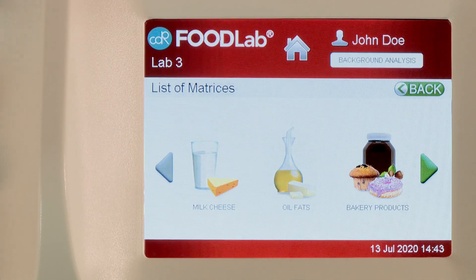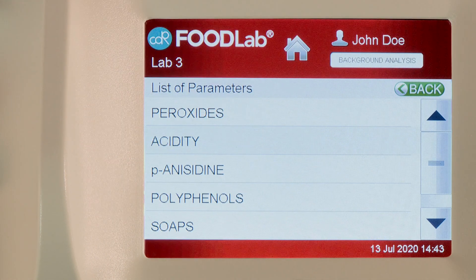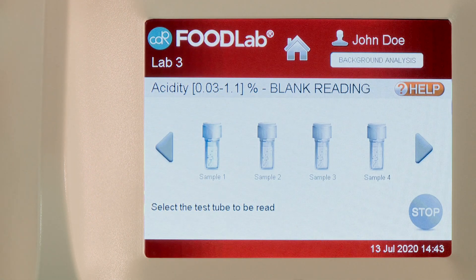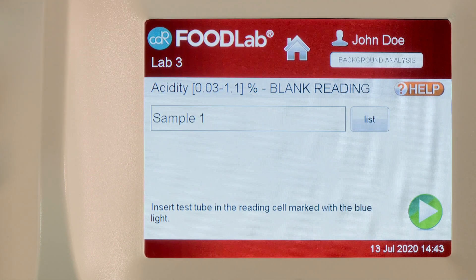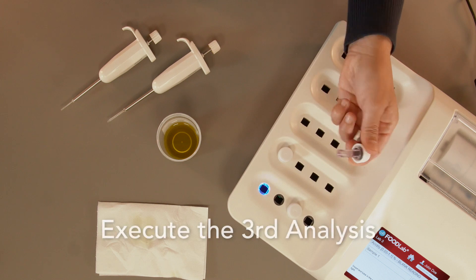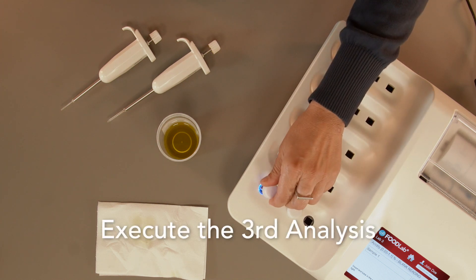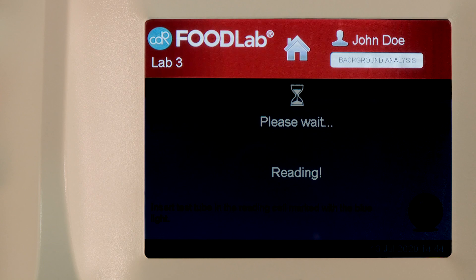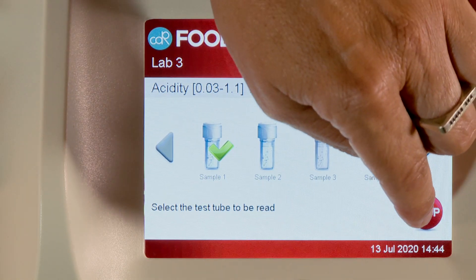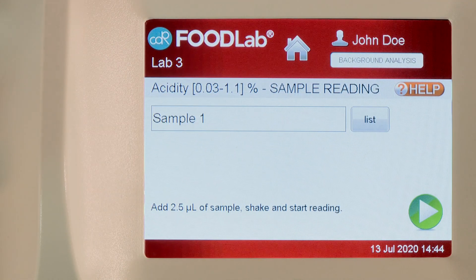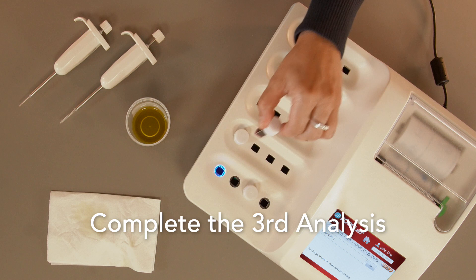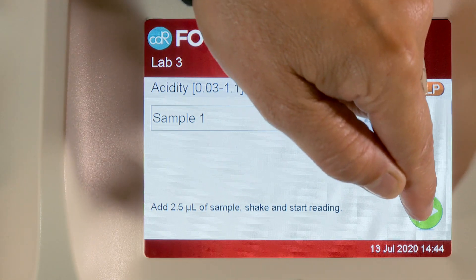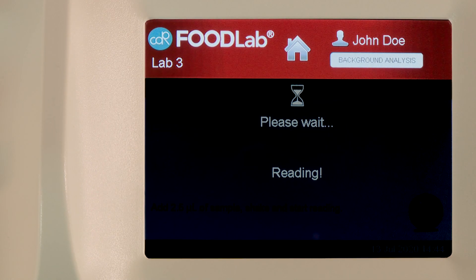Then, select the third analysis from the menu. Then, press Next to start the photometric reading.